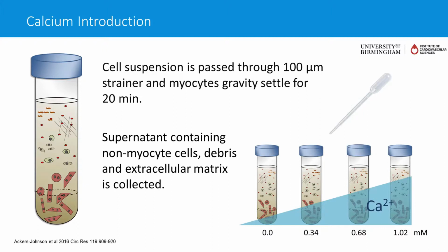I would now like to invite any questions or any further comments from Matt and Ronglih. I would only add that this is what I was trying to describe when I said this is how you can remove BDM as well. Because at the same time as increasing your calcium concentration, you can sequentially reduce your BDM concentration as well. So at the end, you would have a situation where the cells are resuspended in buffer with no BDM. Yes, I think that makes complete sense.